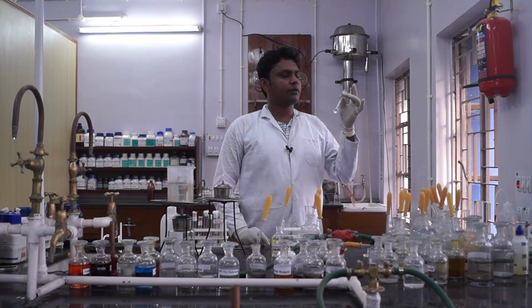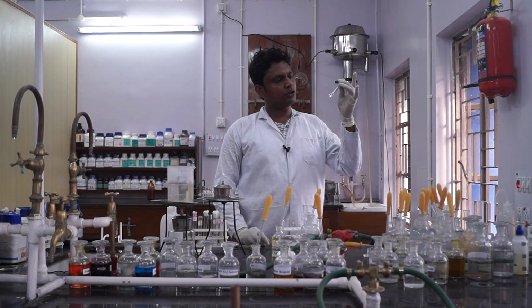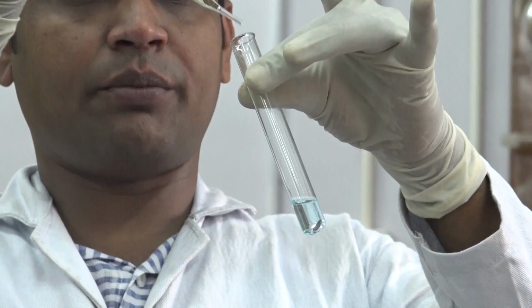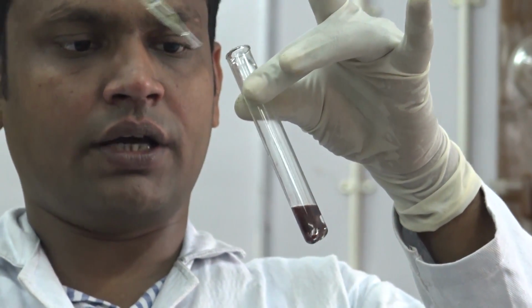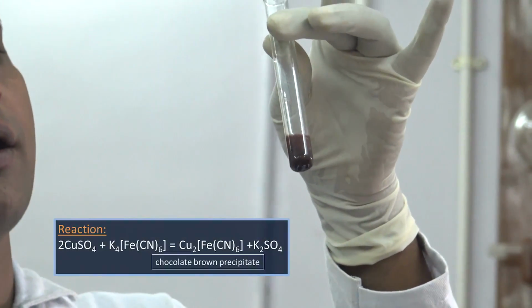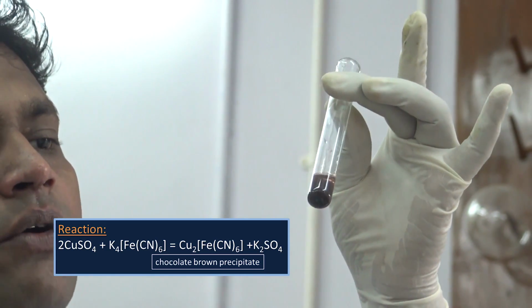Another test is the potassium ferrocyanide test. For this, we will take the second part of the solution and add 1 or 2 drops of potassium ferrocyanide solution into it. Here we can see the formation of a chocolate brown color precipitation, which confirms the presence of copper ion in our sample.